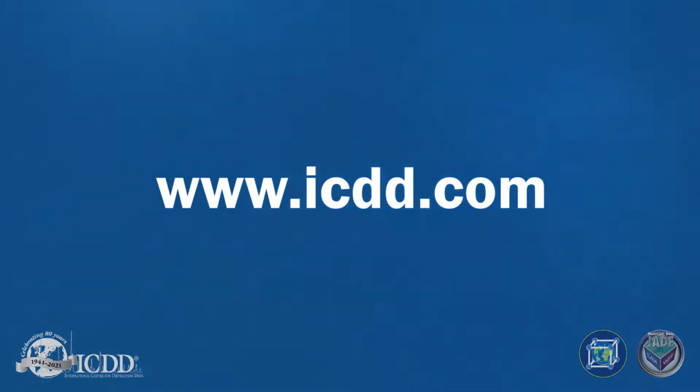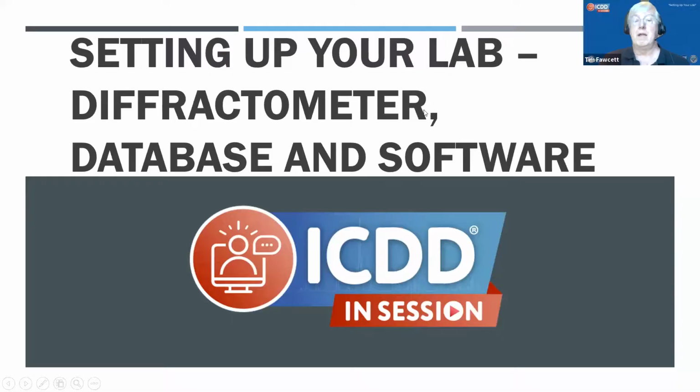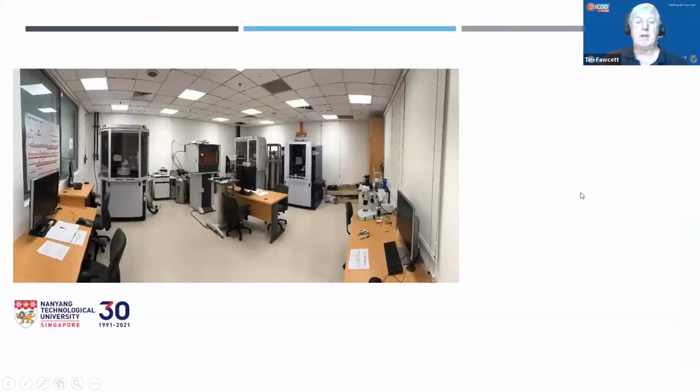Okay, today we're going to talk about setting up your lab and the type of diffractometer, database and software that you may need. And here we have a photo of a typical lab. We have 3 diffractometers. You can see some complementary techniques, a microscope over here, a microanalysis area over here, and plenty of room for people to do their analyses.